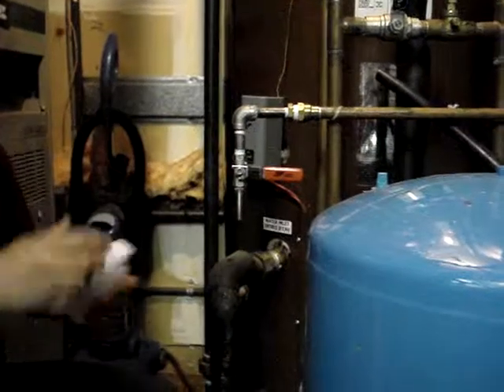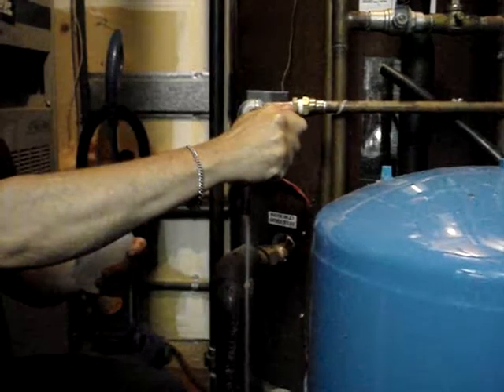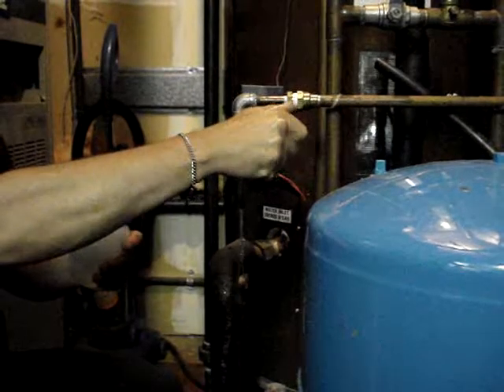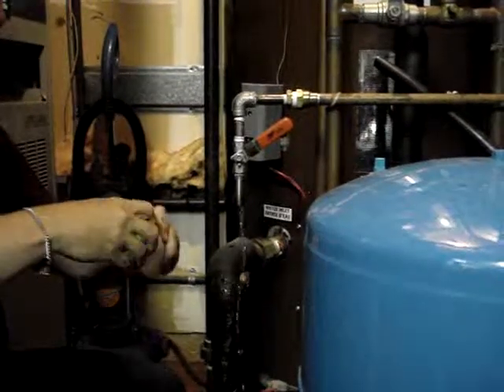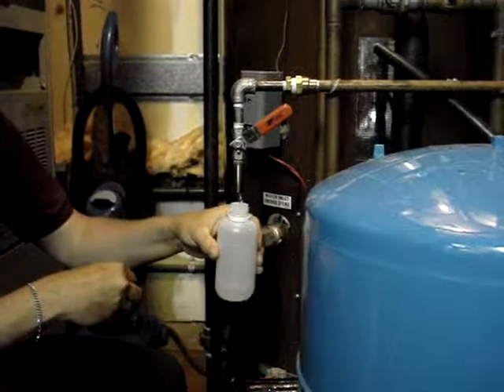I like to hear the thing sizzle when I open it up. So we don't get any backsplash, get it to a controllable volume. Make sure you're not touching the inside of the bottle.